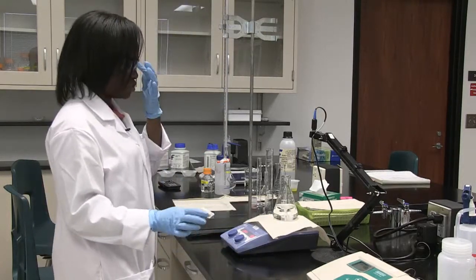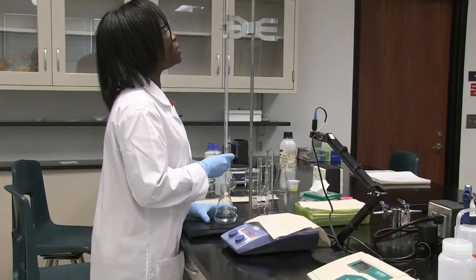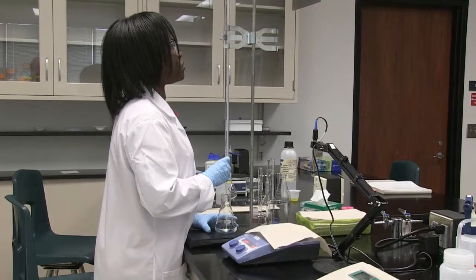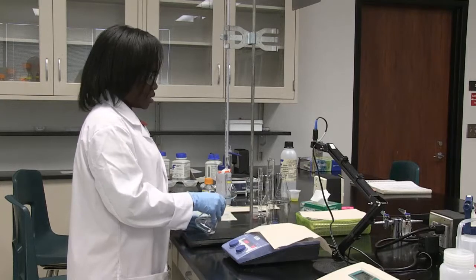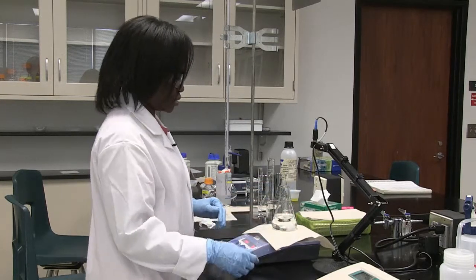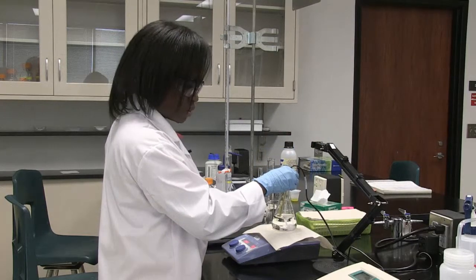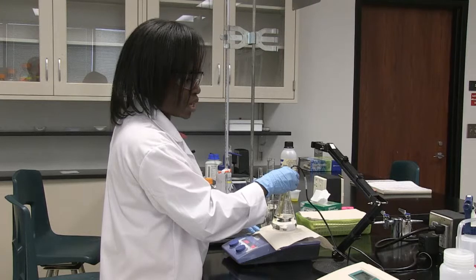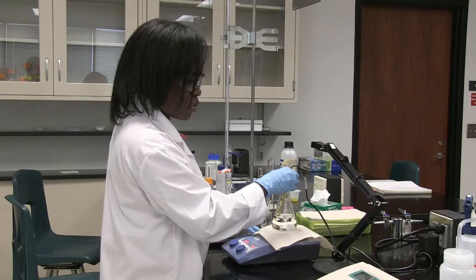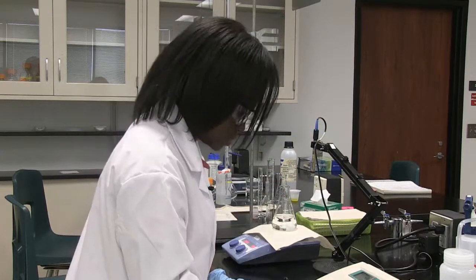I add another 0.5 mL of sodium hydroxide, waiting until the burette reads 16. Then I mix and record the pH — this is the pH after adding a total of 1 mL of sodium hydroxide. Once the reading stabilizes, it's 4.81. It's going up a little, but not by a drastic amount.